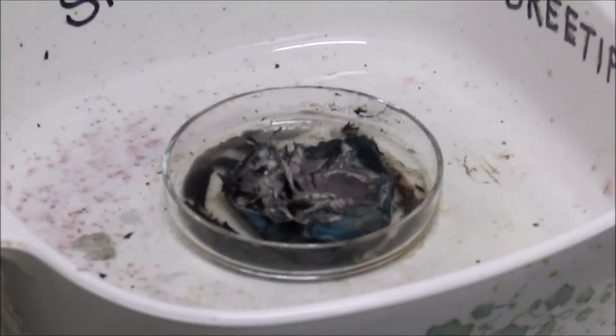The palladium salt has been calcining now for right at one hour. I just hit it with a little bit of flame there to finish off the paper. Now what I'm going to do is turn this off and let it cool down to room temperature, and then we'll put it in a crucible and melt it up into a button.